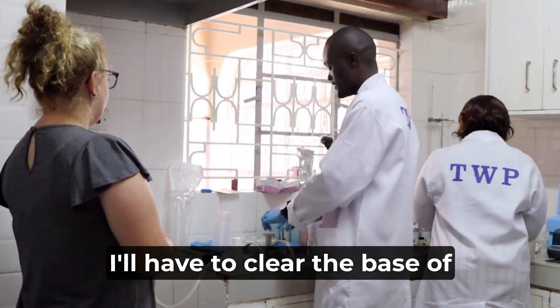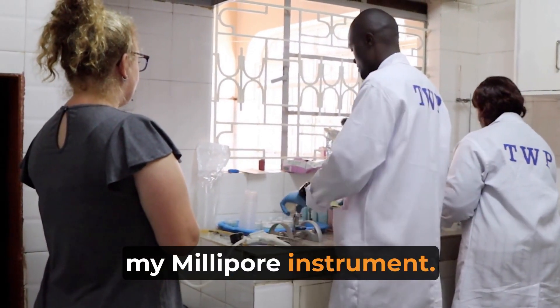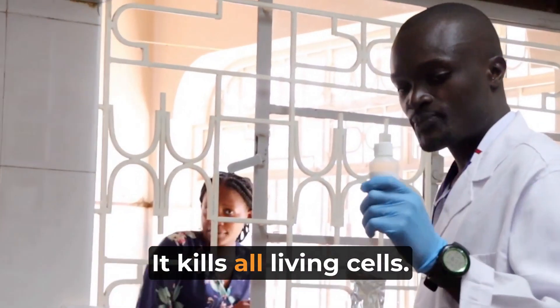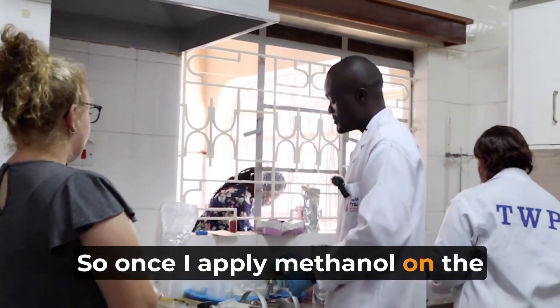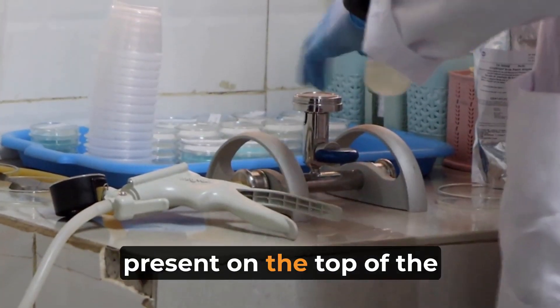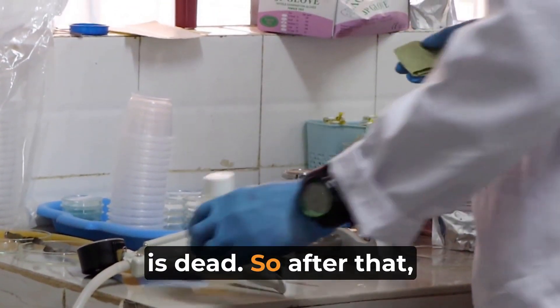First of all, I'll have to clear the base of my milipo instrument. I'll clear it with methanol. Methanol is a biocide — it kills all living cells and denatures them. So once I apply methanol on the base, whatever biological cell was present on the top of the milipo has been cleared or is dead.